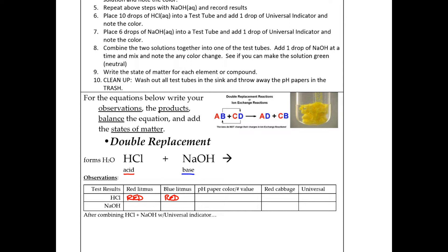The NaOH, by contrast, the red litmus paper turned blue and the blue probably got a little more blue, but either way they both turned blue.